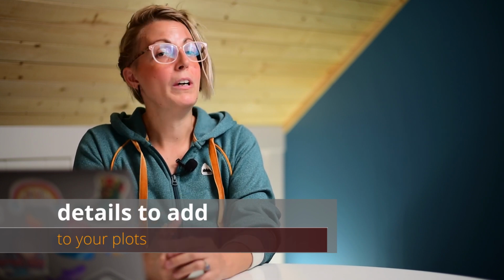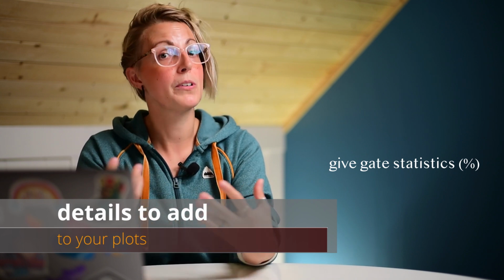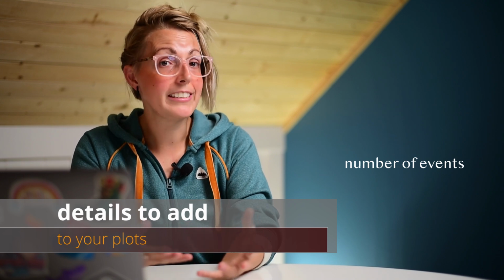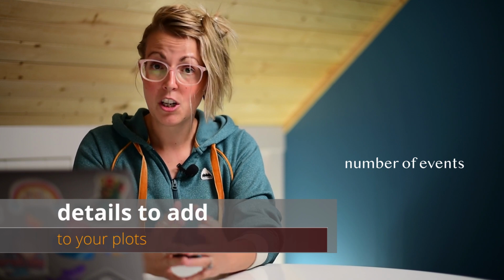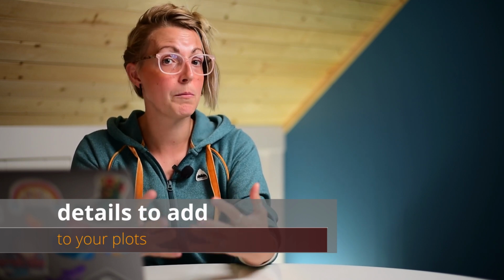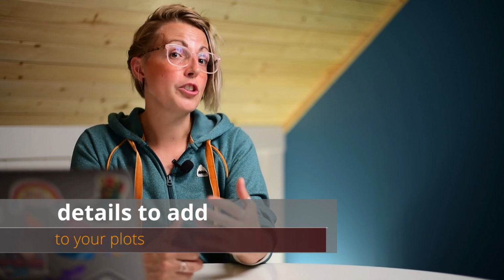This will also allow people to see if your scale is log or linear, which again is important for interpreting the data. When dealing with your gates, it's important to give a gate percentage on these plots so that people know where you're getting your percentages from when you start presenting your data in more graphical formats. Similar to your data acquisition, it's also a good idea to put the number of events on your plot, especially if you're using contour plots. When using a contour plot, it may look like there's a lot of data on that plot, but that data may only be representative of a few data points. So if a person knows that there's 10,000 events on this plot versus 100 events on this plot, it can greatly affect how they interpret that data.